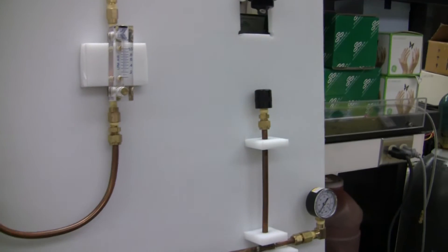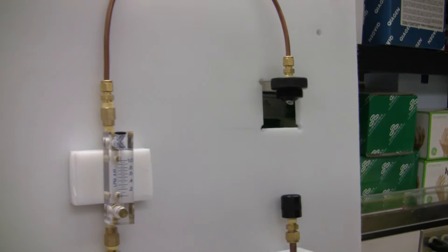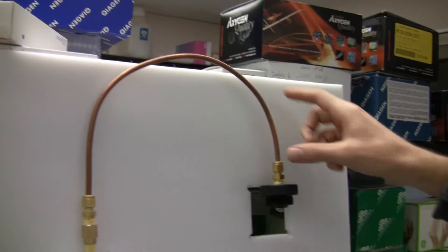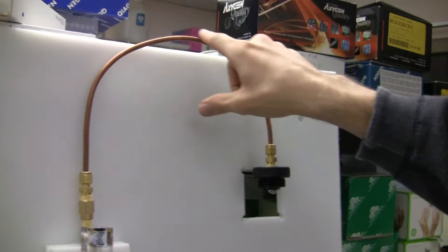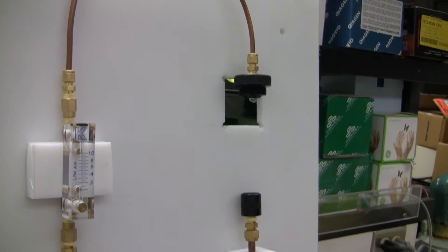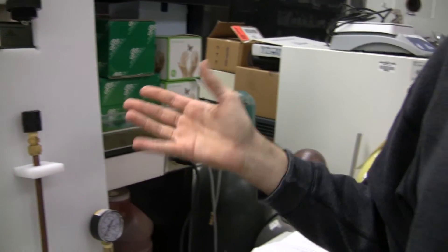And then with the oxysorb. So your oxysorb looks like this. We've designed this copper tubing to give you some flexibility when you put a new one in or exchange your old one.